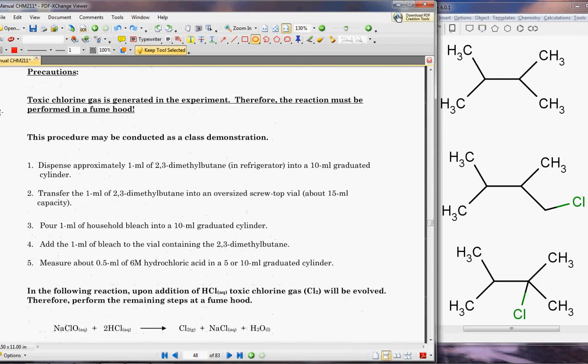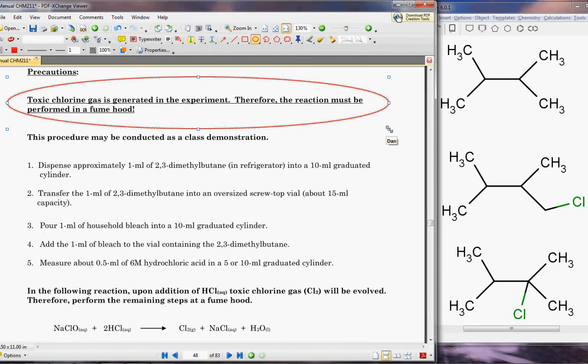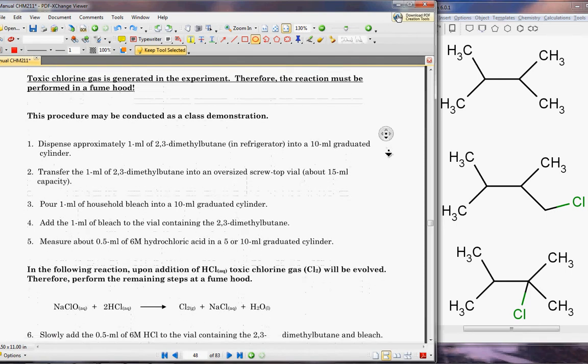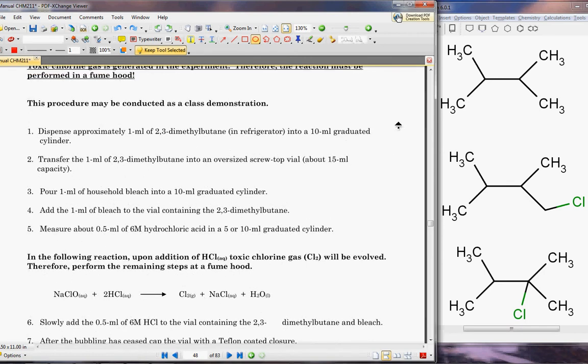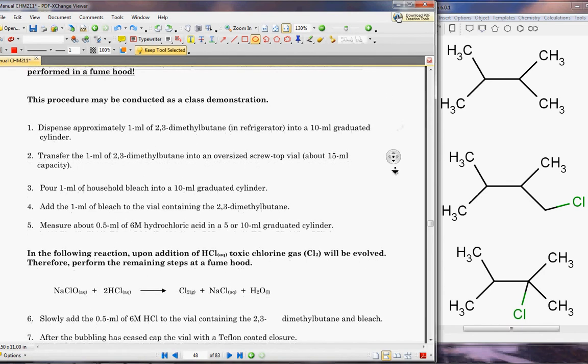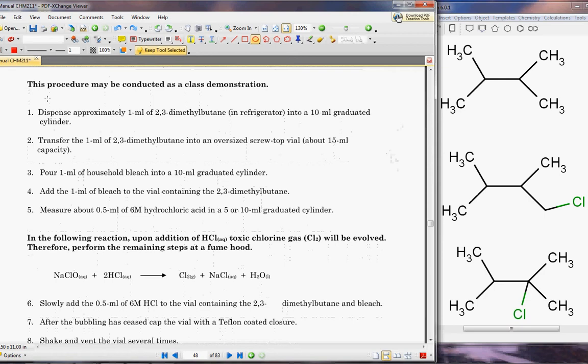Let's talk about the procedure. Before we start, I just want to really, really strongly tell you guys that toxic chlorine gas is generated in this experiment. Therefore, we have to perform it under the hood. Be very careful not to stick your head under the hood and try to sniff this chlorine gas because it is very, very toxic. I know you guys are all professionals.